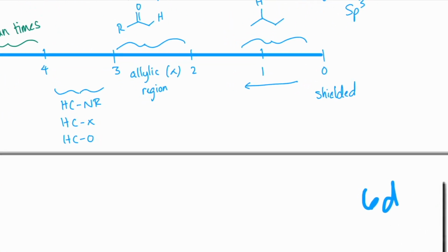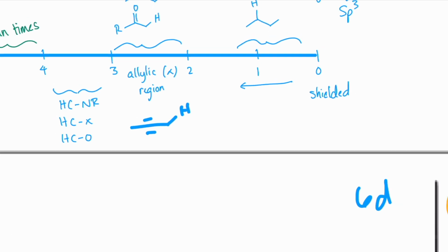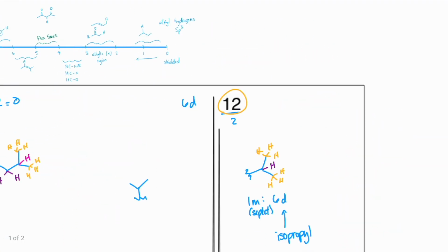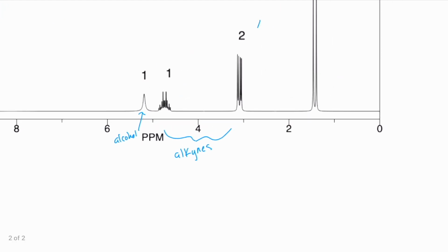Although technically allylic, it would be there, but oh well. Okay. Well, yeah, that matches up. Okay. At least this one immediately matches up. This one's pretty darn high. But once again, maybe we're considering multiple functional groups. Okay.